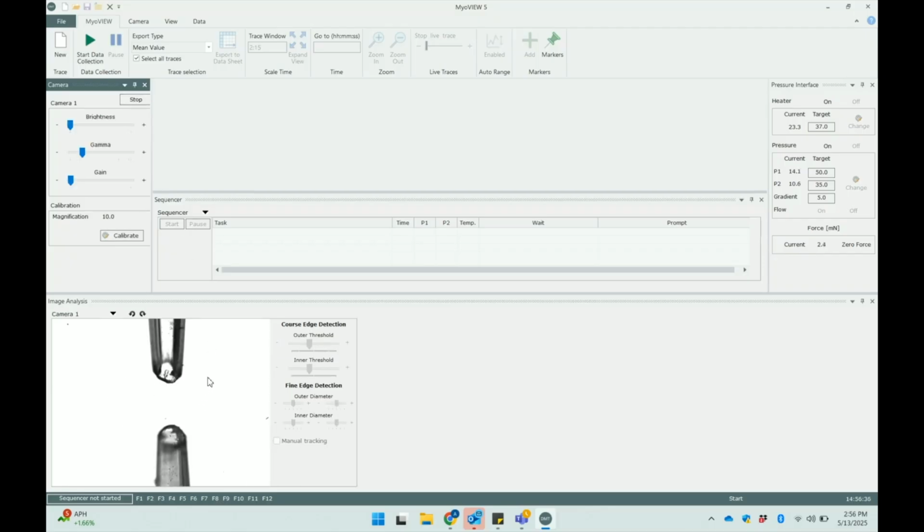Here you can see two glass cannula tips lined up. You can identify the P1 and P2 cannulas by slightly moving the P1 cannula on the chamber itself. Since P2 is fixed to the force transducer, you can tell them apart when P1 starts to move.